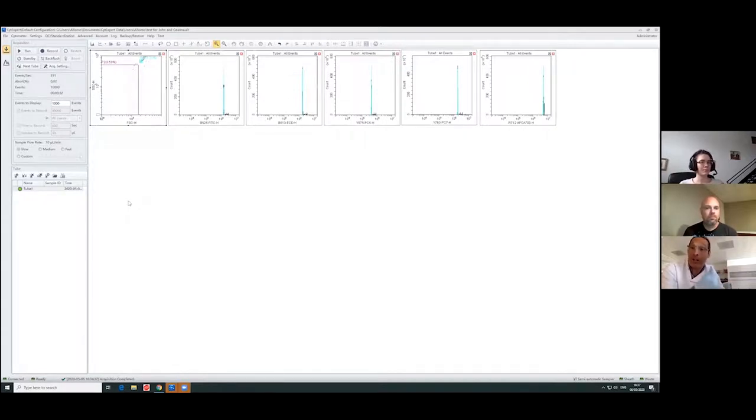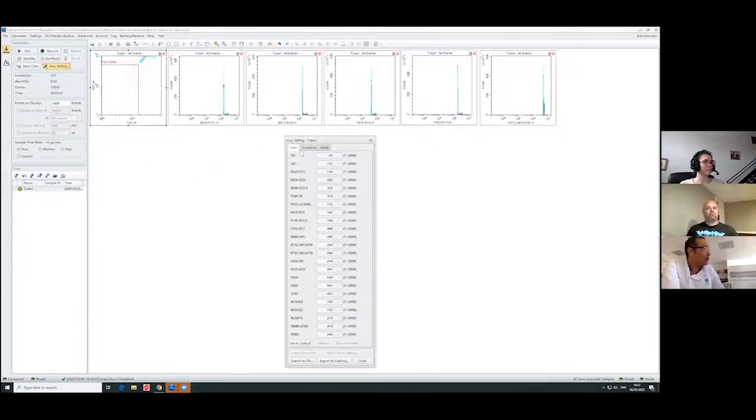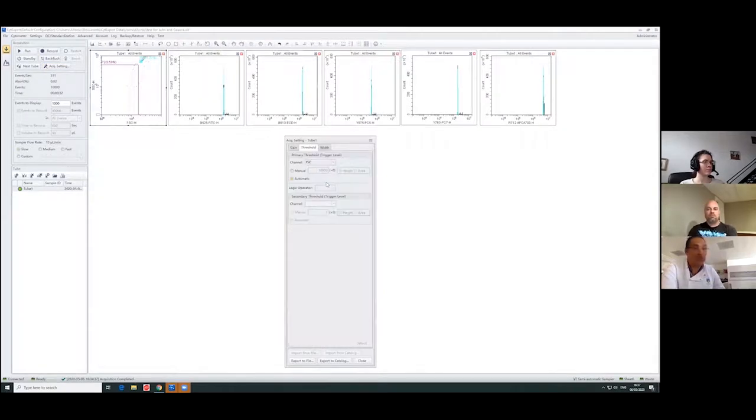You have seen my air bubbles. These beads tend to break down, so you'll see portions of these beads, dust, and things like that. Okay? So we cannot see it because we have something called threshold. So the threshold is something that we have access to here. You can see that place is called threshold. So that's a tool that we'll be using to modify the actual thresholding. The actual threshold is something that we have here.